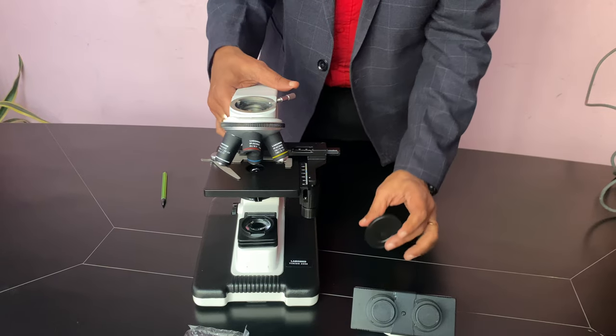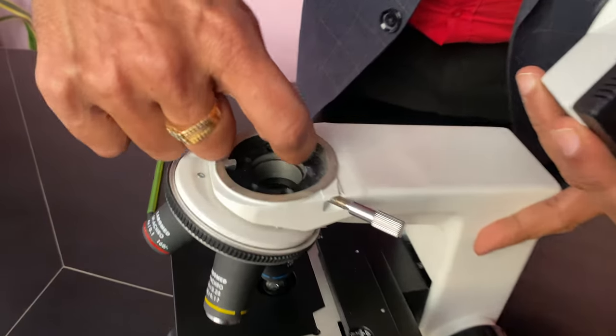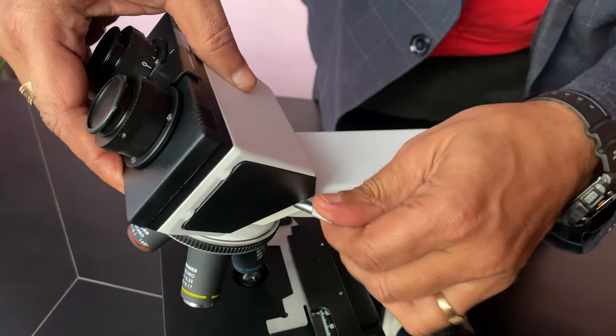There is one notch here. On the head there is also one cap. Inside there is a latch and there is a groove. Put it like this and tighten it.